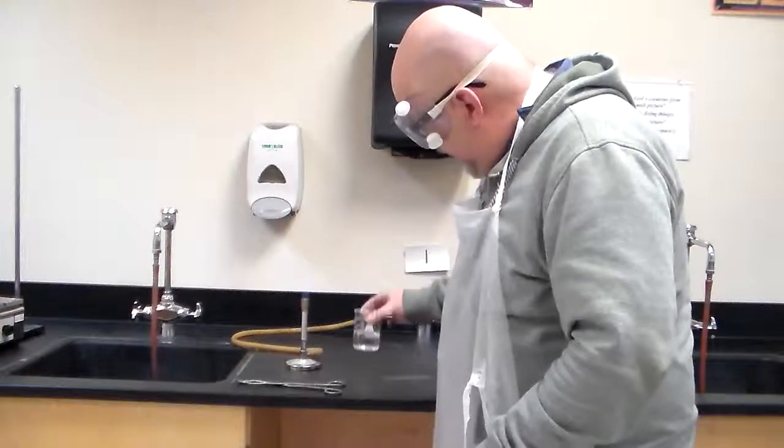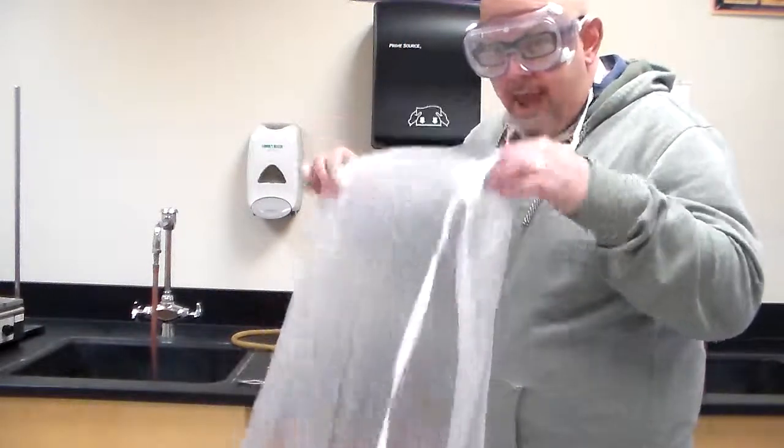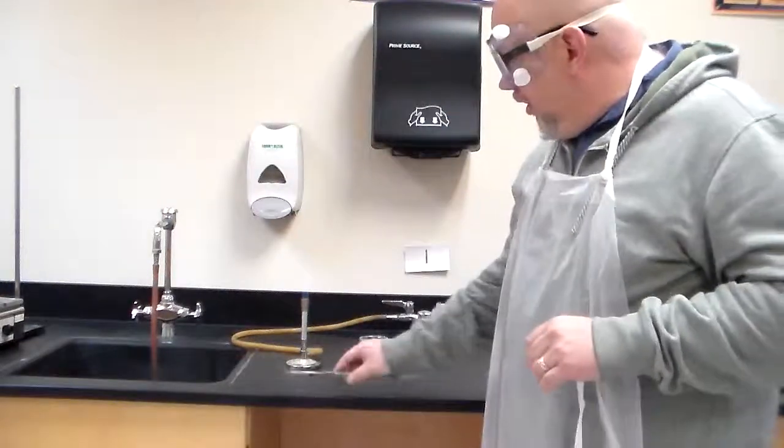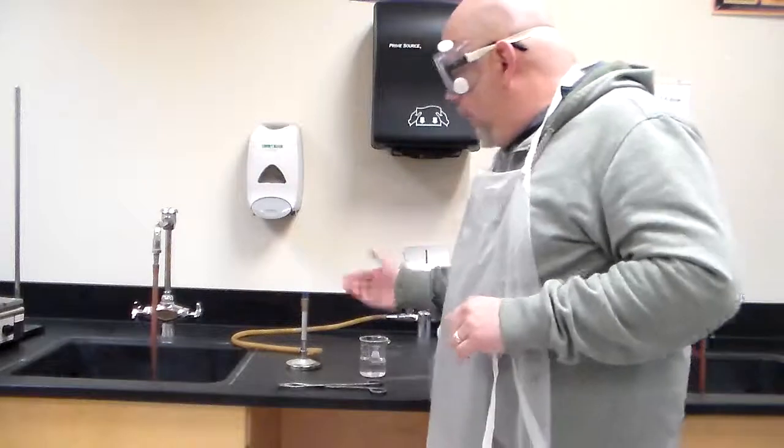So, very quickly, the idea behind the Flame Lab, yes, you get to set something on fire. That would be the toothpick. We have our safety with the beaker full of water. For safety gear, apron, goggles. You're going to need your tongs to hold on to the toothpick, and we're going to need a working lab burner in order to make this happen. And like I said, you're going to be observing the color.